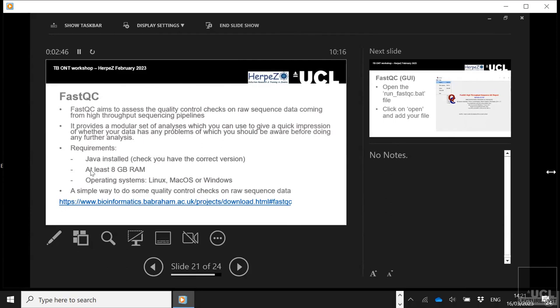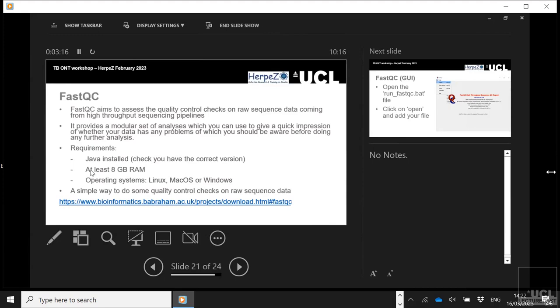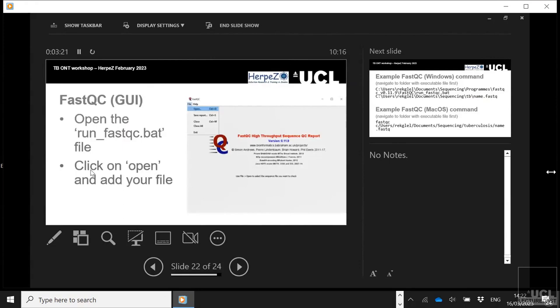FastQC requires Java, so you need to install Java on your laptops if you haven't already. You need a machine that has at least eight gigabytes of RAM, and you can run it on Linux, macOS, and Windows. This is the website where you can go to download all of those versions. It's a graphical user interface. So after you download it, you just click to run the batch file, and then the screen will come up. Then you just hit open, and it brings up the window that shows you what files you have, and then you pick the appropriate file to open. And then you run it.